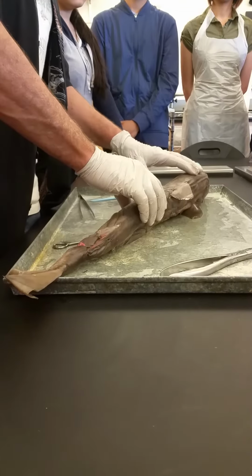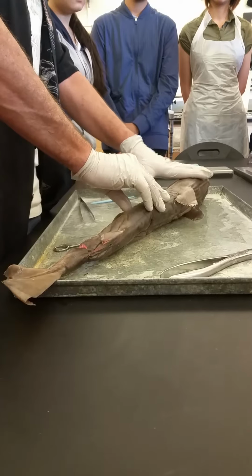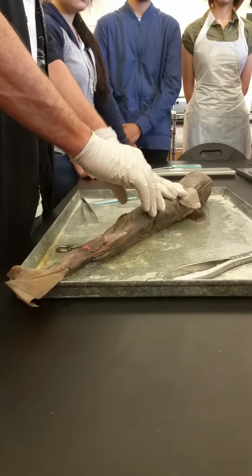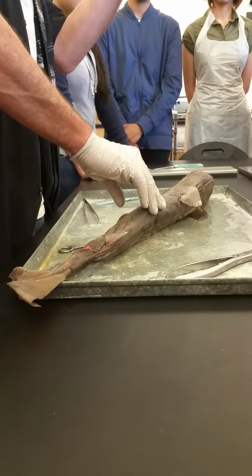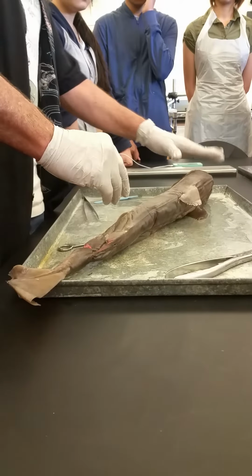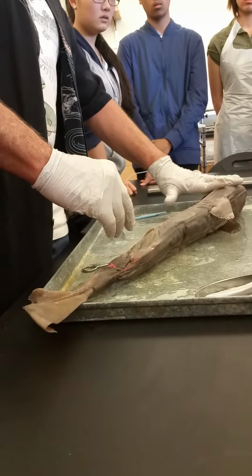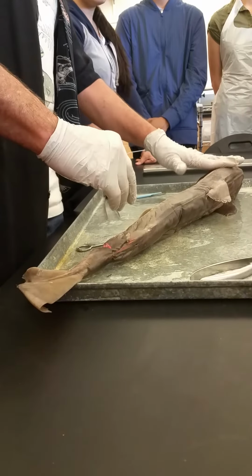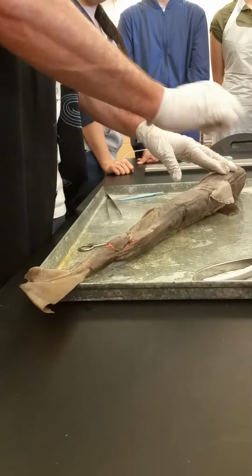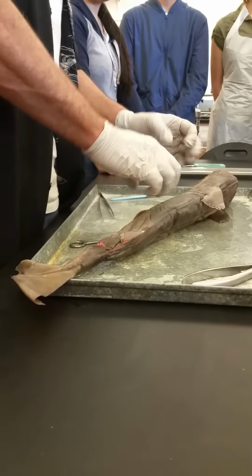Okay? Now, they don't have scales. What they do have is teeth. They actually have teeth in their skin. They're called dermal denticles, skin teeth. And they actually have the whole enamel, pulp, dentin structure of a tooth in every one of these little bumps. And they're, again, pointed backwards for streamlining. So if you stroke a shark from nose towards the tail, it feels very smooth. You go the other way, and it feels rough, because now you're going against the teeth. And in some sharks, it's very rough. And in fact, in some cultures, they actually use it as sandpaper, as abrasive for polishing. Or samurais would wrap the hilts of their swords with them to get a better grip.